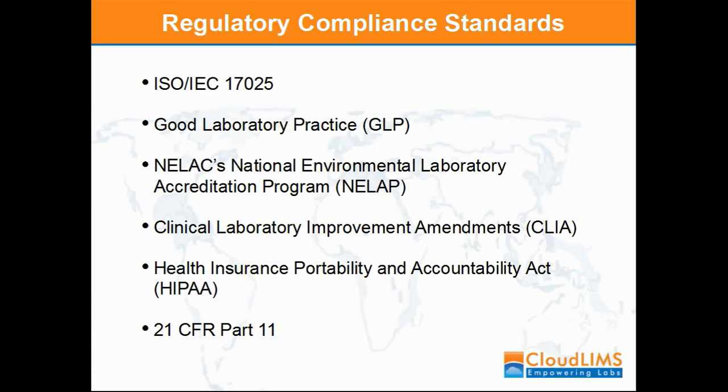Proper ventilation of a testing lab is crucial to avoid any cross-contamination. The temperature and humidity should be monitored closely round the clock. All testing equipment required for sampling, processing, and analysis should be available in standard conditions in the lab. Additionally, the instruments requiring calibration should be calibrated to ensure accuracy of test results.